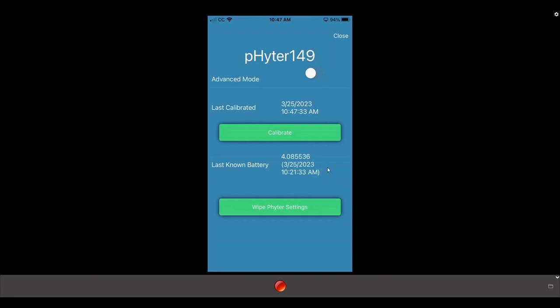Also check on the battery power. This should be somewhere around 4 volts. When it gets down to around 3.8 volts, you'll need to recharge.